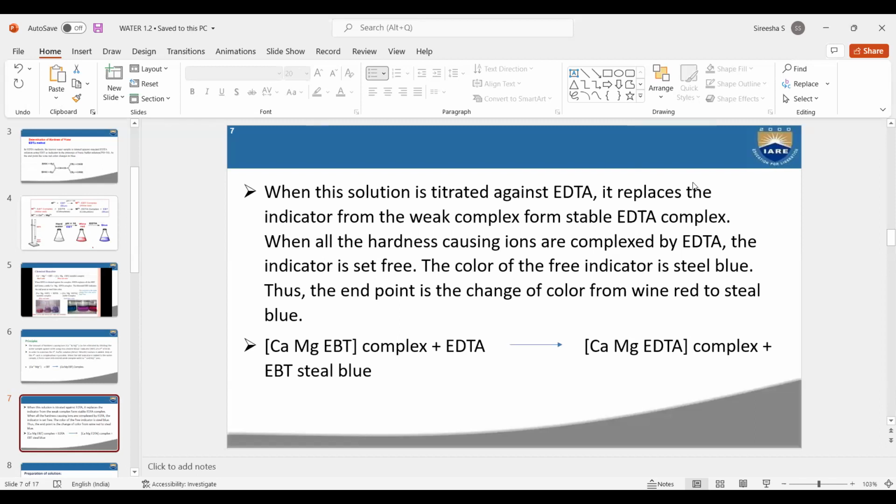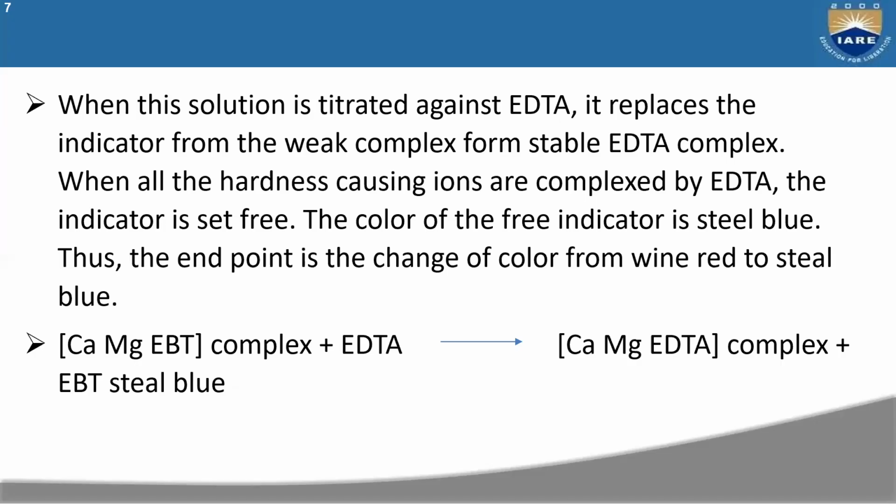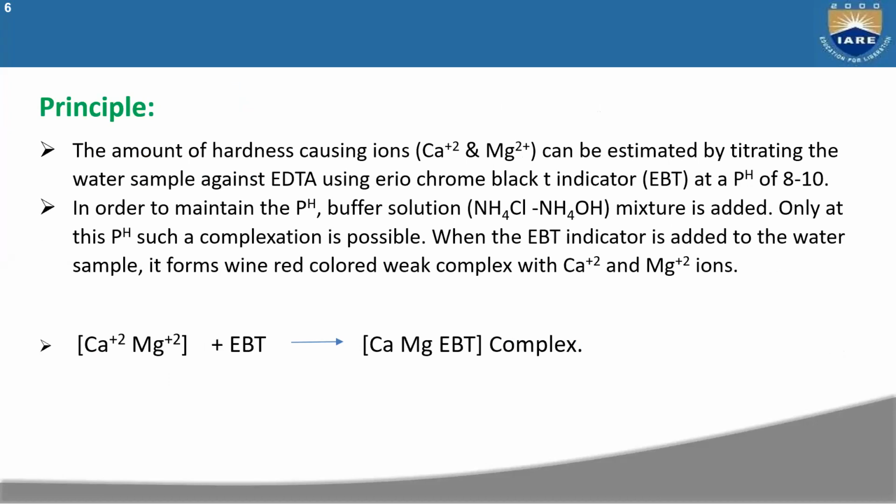What is the full form of EDTA? Ethylene diamino tetraacetic acid. Okay. So, estimation of hardness. See the principle: the amount of hardness-causing ions, calcium and magnesium, can be estimated by titrating the water sample against EDTA.